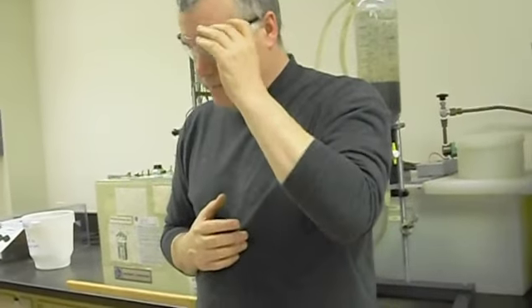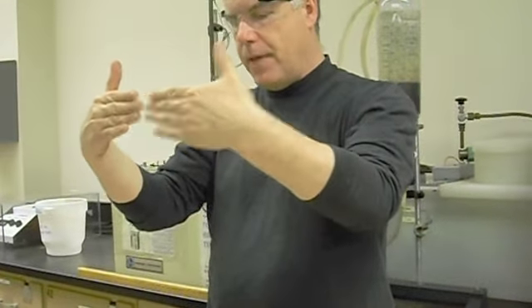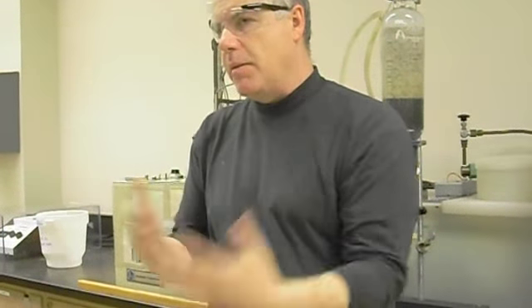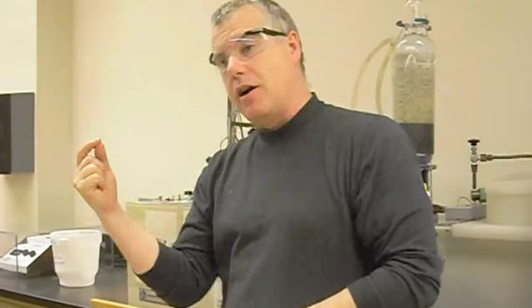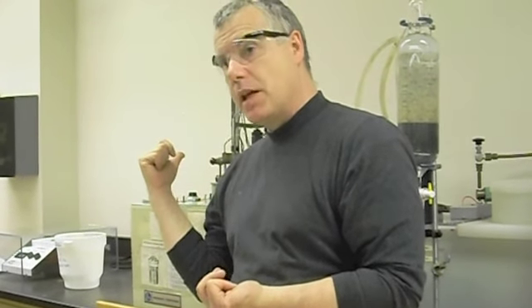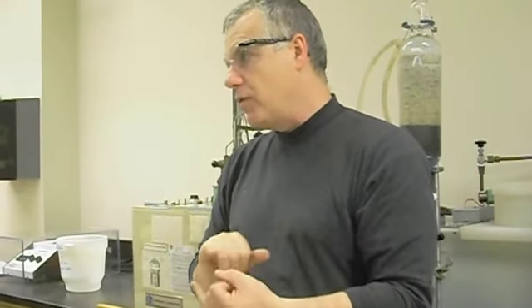Now you see, the idea of doing the differential error propagation is when you have various sources of error that aggregate into a single result, and you have to account for those errors. A couple things may be happening. One, it's expensive or inconvenient to reproduce all the measurements, or there are unknown components to the errors that you're trying to account for. But in this case, since we can reproduce the calibration, we can get a standard error in the enthalpy, or at least the delta T value for the benzoic acid calibrant. A real honest error estimate is made by reproducing that. And then a real honest error of the two analytes, the phenanthrene and the anthracene, can be had by reproducing the measurement.